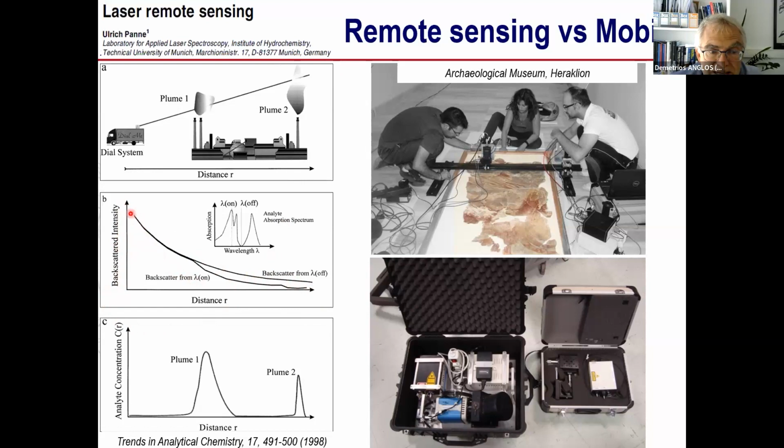But sometimes we see further reduction of the backscatter light because at some point along the path there is some substance, some smoke, that is partially absorbing and therefore reducing the intensity of the beam, both ways. And in fact, if we do this right, we can get a spatially resolved distribution of the pollutants. We know which pollutants we have because we know how to tune our laser at certain wavelengths.